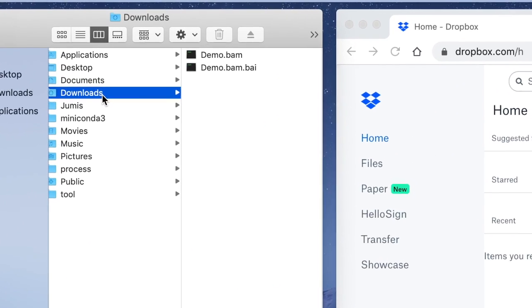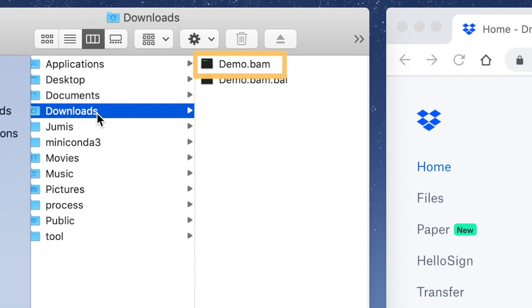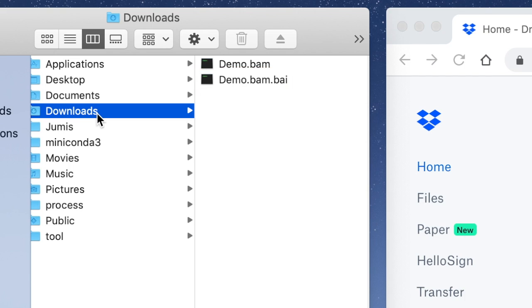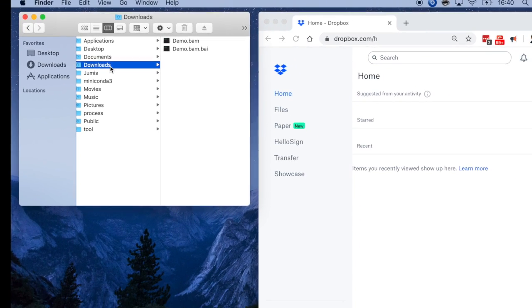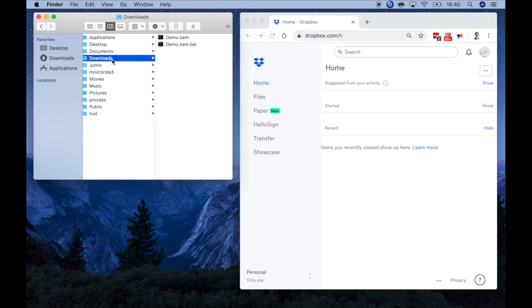Here I have a sequence alignment file with its corresponding index file locally on my computer. Let's say that I know I will want to share some IGV views of this sequencing data with my colleagues. To do this, I first need to make sure the data is accessible to them. One way to do this is to upload these sequencing data files to my Dropbox account.